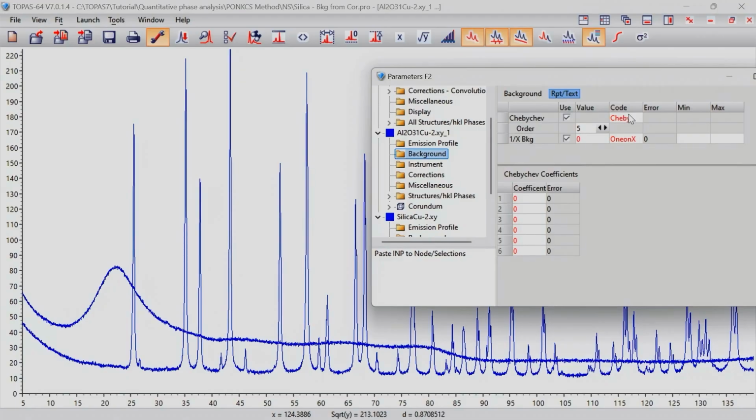And if I'm doing that, this will allow me to do a constraint to other parameters, specifically the background parameter in the second powder pattern here. And if that has the same name, there will be one background function refined on both patterns, right? This will allow me to get the pure amorphous phase without the instrument contribution.